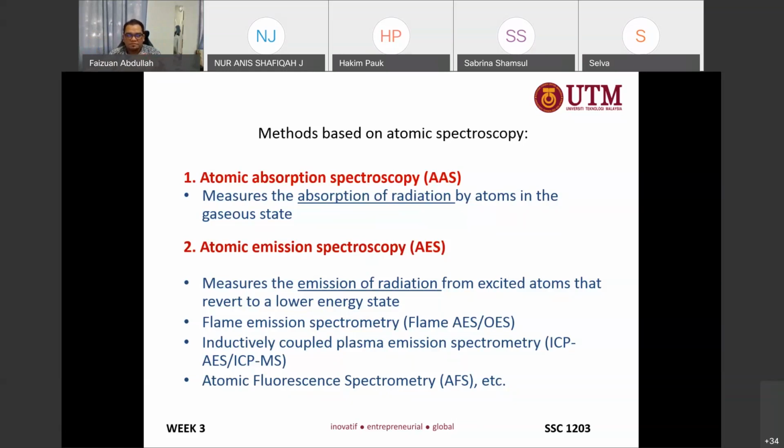Am I correct? So a metal in only low concentration can also be detected by AAS. But AES needs a very high concentration, because the detector detects the emission of the energy, and it's difficult for the detector in AES to detect that. Instead, the detector in AAS detects how much energy is absorbed, the energy lost from the light source.